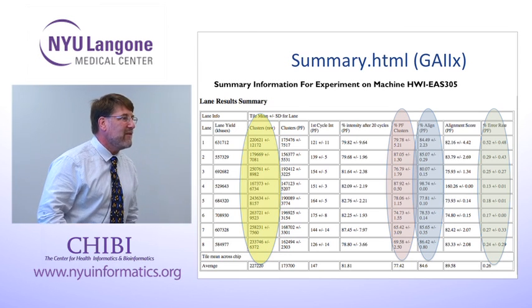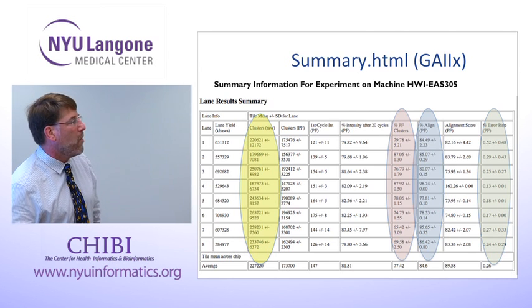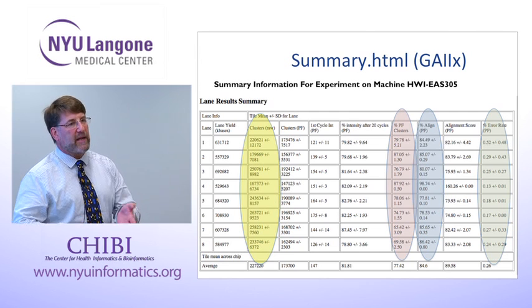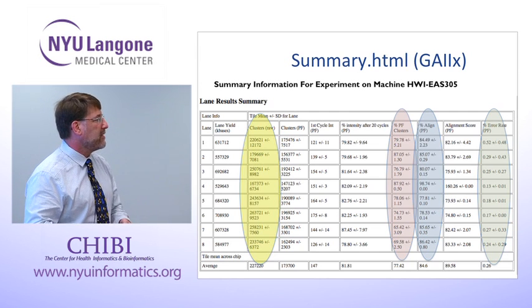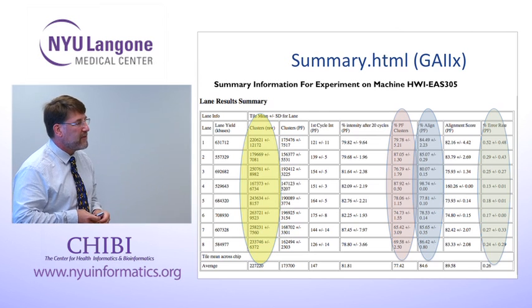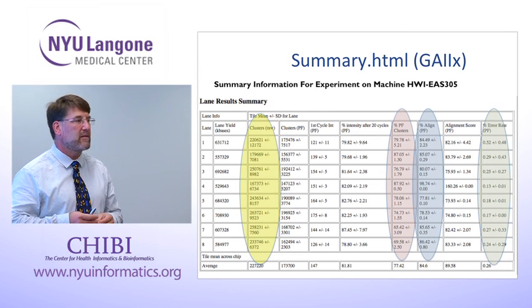Anything less than 70%, we get out the QC tools and start looking at what happened to your sample. What is in this batch of sequences that fail to align? Are they all ribosomal, so your poly-A wasn't very efficient? Is it a virus contaminating your sample? That happened to us once.